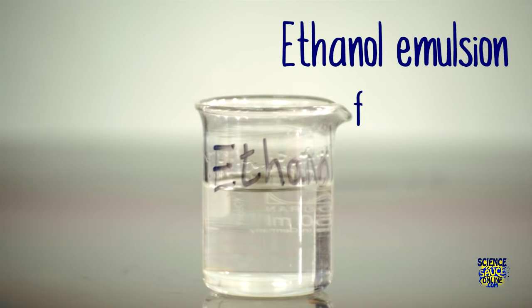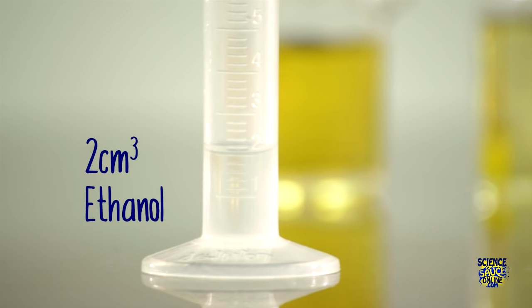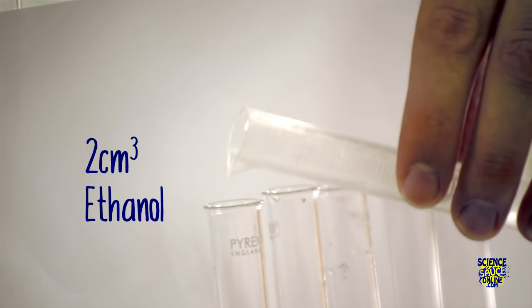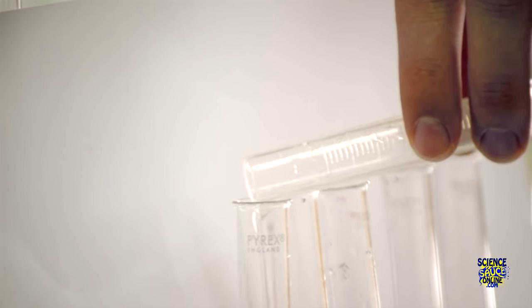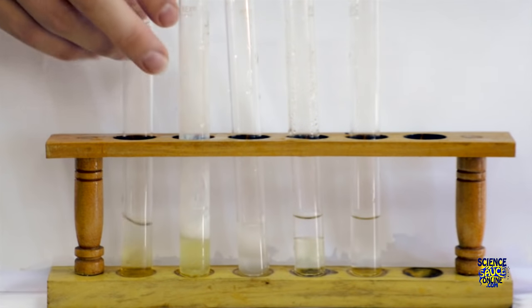The ethanol emulsion test is the test for the presence of fats. First you need to measure out two centimeters cubed of ethanol and pour that into each of your samples. With each one you need to shake it vigorously.